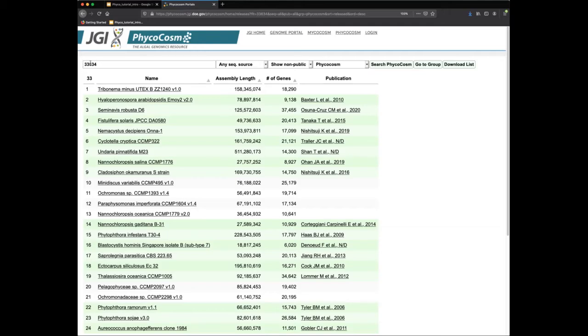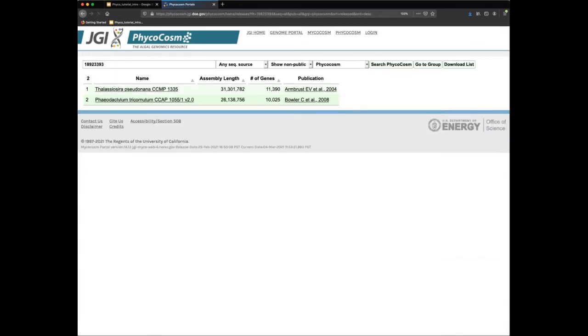For example, we can try to look for the Phaeodactylum genome paper, which has PubMed ID 18923393. The paper also involved improvement of the genome of Thalassiosira pseudonana, so that diatom also appears on our list. And finally, if you are fond of a particular author's work, you can search by their name and see all published genomes they are associated with.